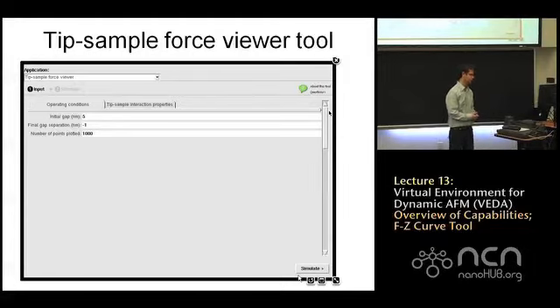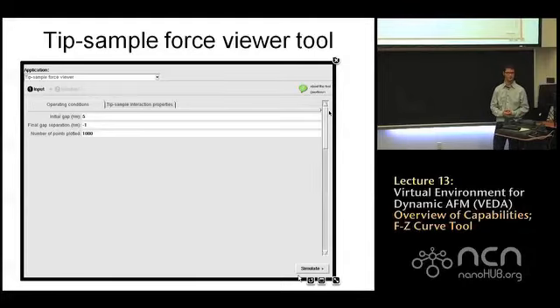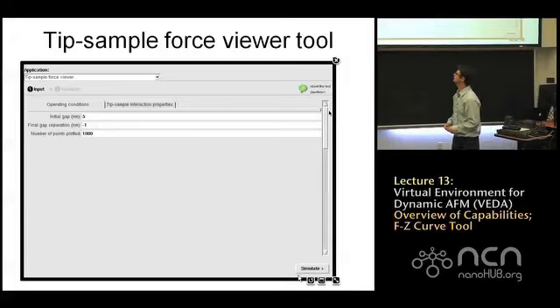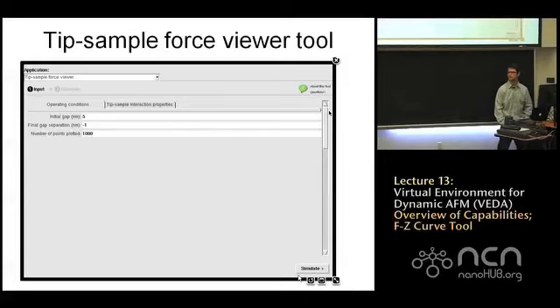John, they did not enter those numbers. Can you please go back? Make sure you're asking them to enter 5 and minus 1 in there. Do you want them to do that? Yes. Okay, so please give that instruction. If you can change the defaults from, I think it's 10 and 0, to 5 and minus 1 for the initial gap and the final gap in the first two. So does everybody have that?